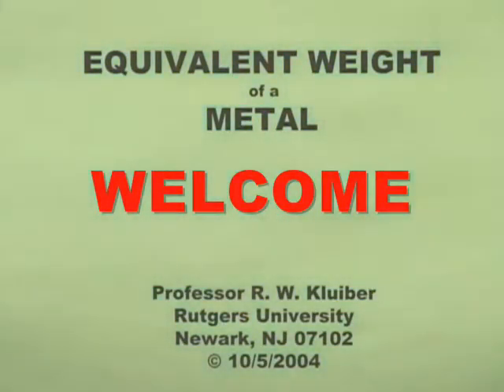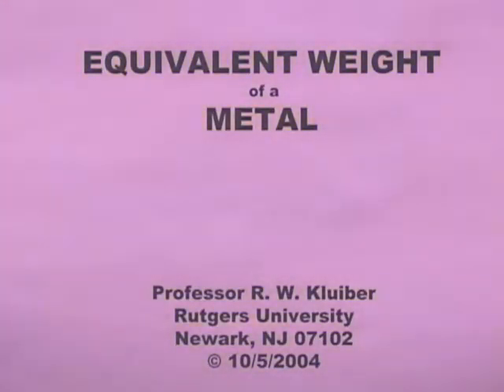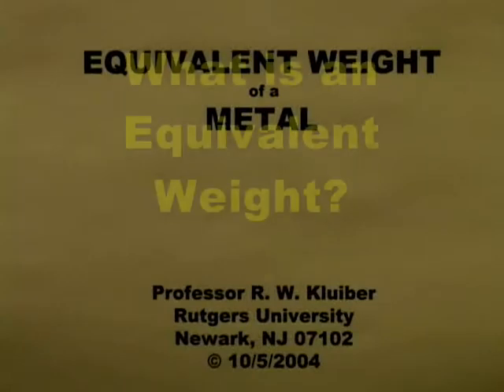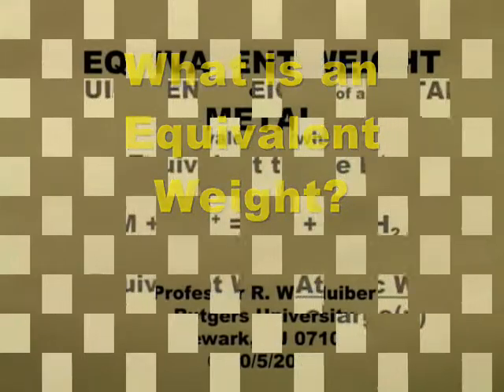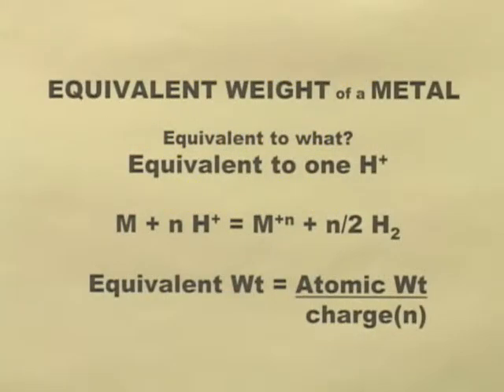Welcome! In this experiment, you'll measure the equivalent weight of a metal. Having said that, you might well ask, what is an equivalent weight? Let's answer that question. Equivalency in this experiment is related to the hydrogen ion.